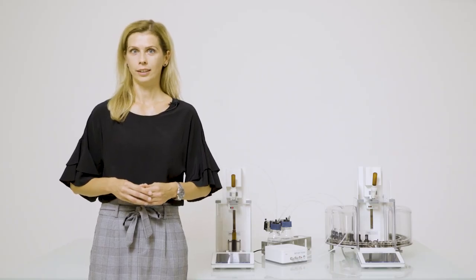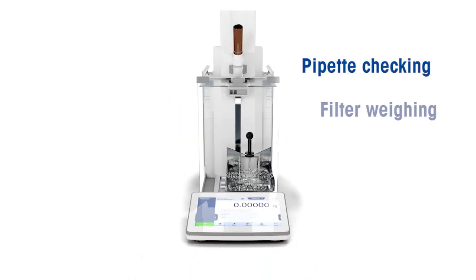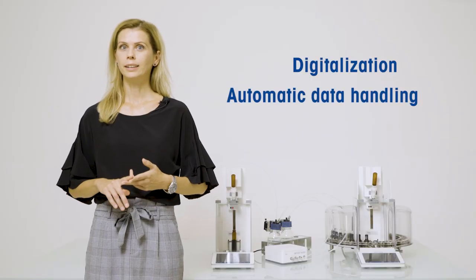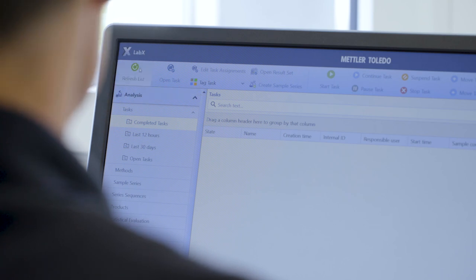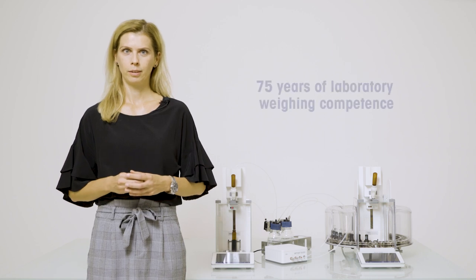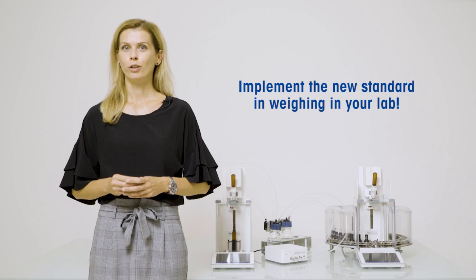Thanks to the innovative design, you can use the XPR Automatic Balance for automated and manual weighing, whatever you need. This way, you lower your initial investment with this flexible multi-use solution. For digitalization, automatic data handling, workload guidance and central data storage, you can connect the XPR Automatic Balance to the LabX Laboratory software. Our revolutionary solution, based on 75 years of Mettler Toledo weighing competence, covers even more sophisticated weighing and dispensing needs. Invest in your future, today.